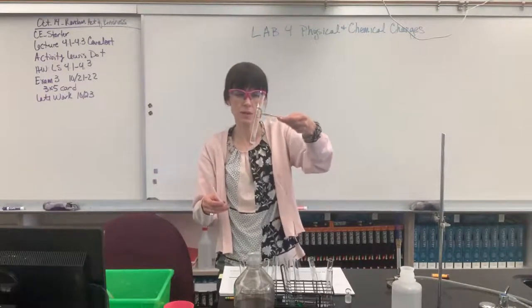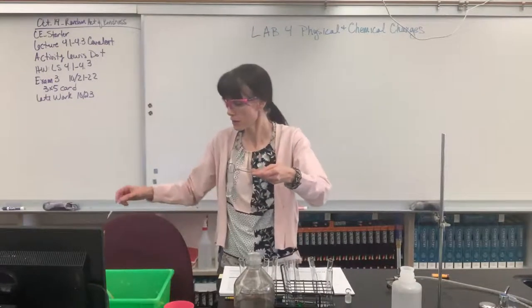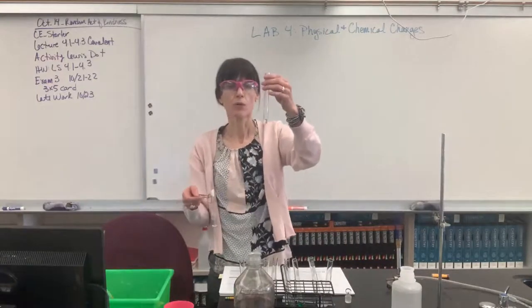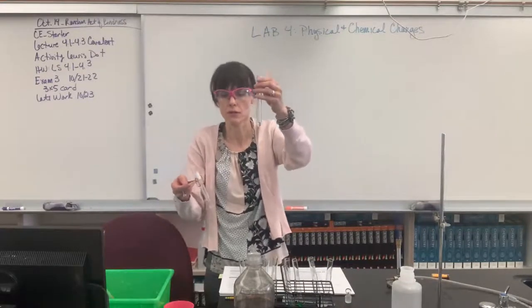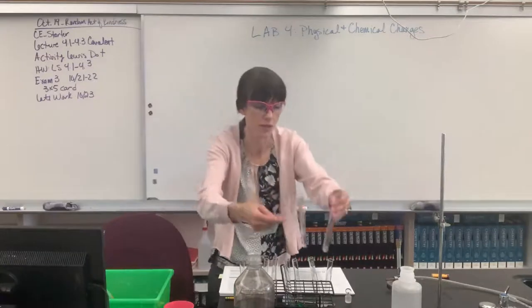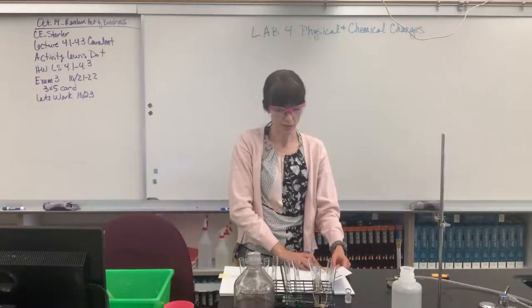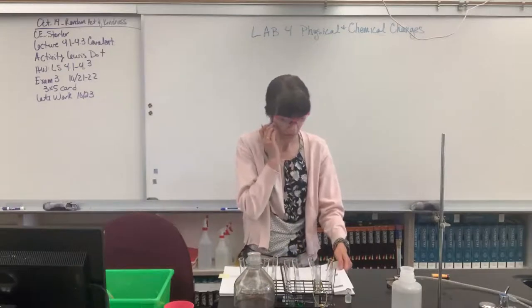Super interesting. Swirling that around, it is identical to the first one. This first one, we had the sodium bicarbonate, added the calcium nitrate to it, nothing. It's clear, no reaction. Same thing, clear. They just look like water. Okay, so let's write that down. Page 54, under part D, result of adding calcium nitrate to dissolved sample underneath recovered solid, clear. Yeah, nothing. Okay, nice.